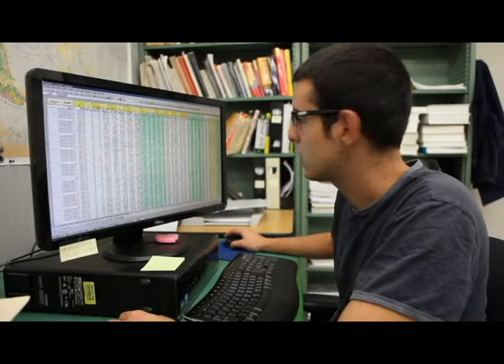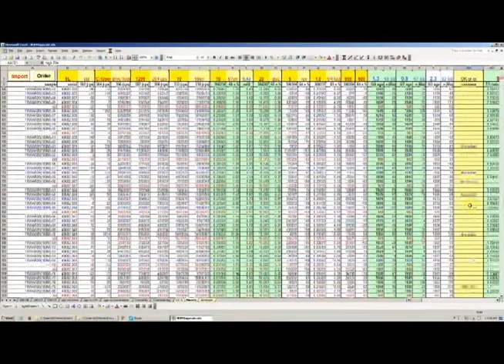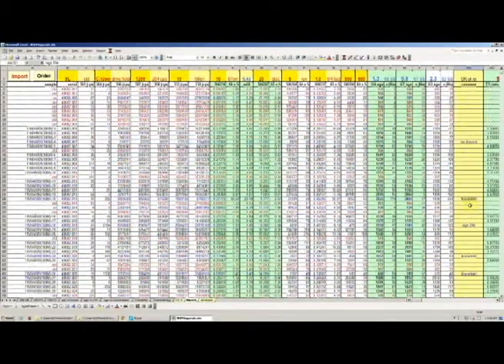So okay, we just finished going down this column. A few more are being discarded because of this high 204. I'm just not going to go above that new threshold of 1200 counts per second. And actually, none of these samples are being rejected because of the maximum uncertainty thresholds that we set for the 6-8 age or 6-7 age, and that's good news. That means that all analyses are more precise than 10%.